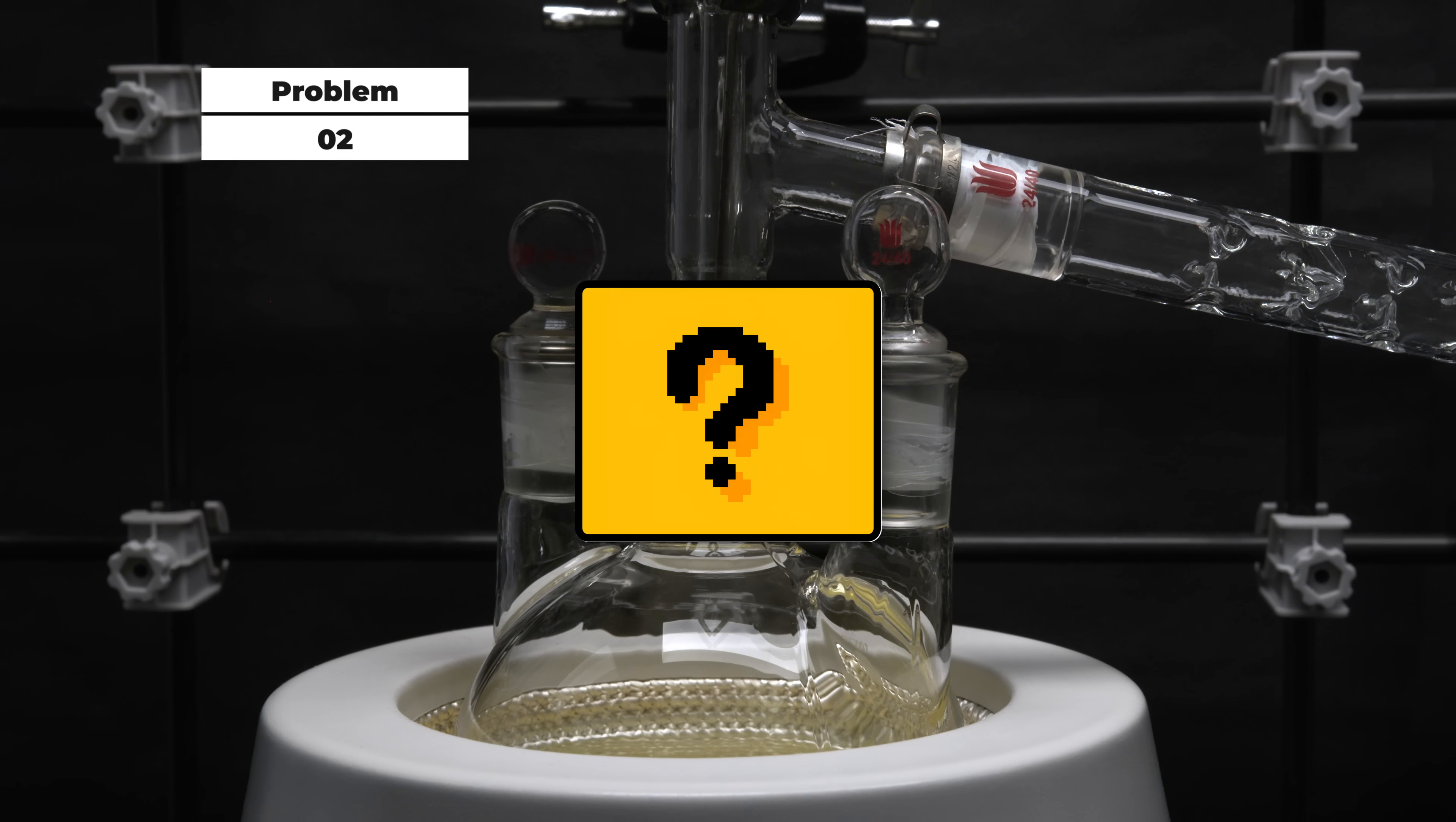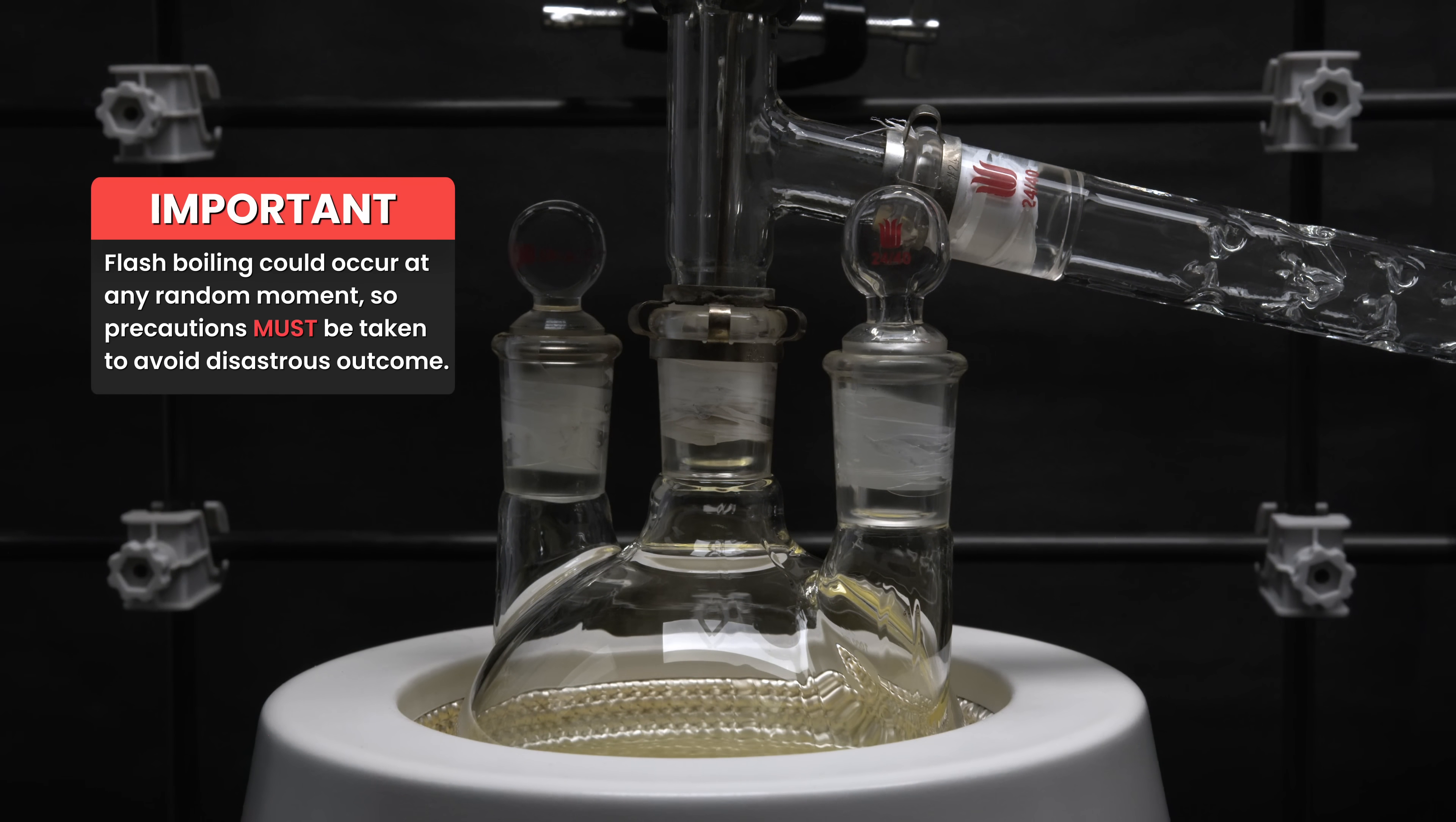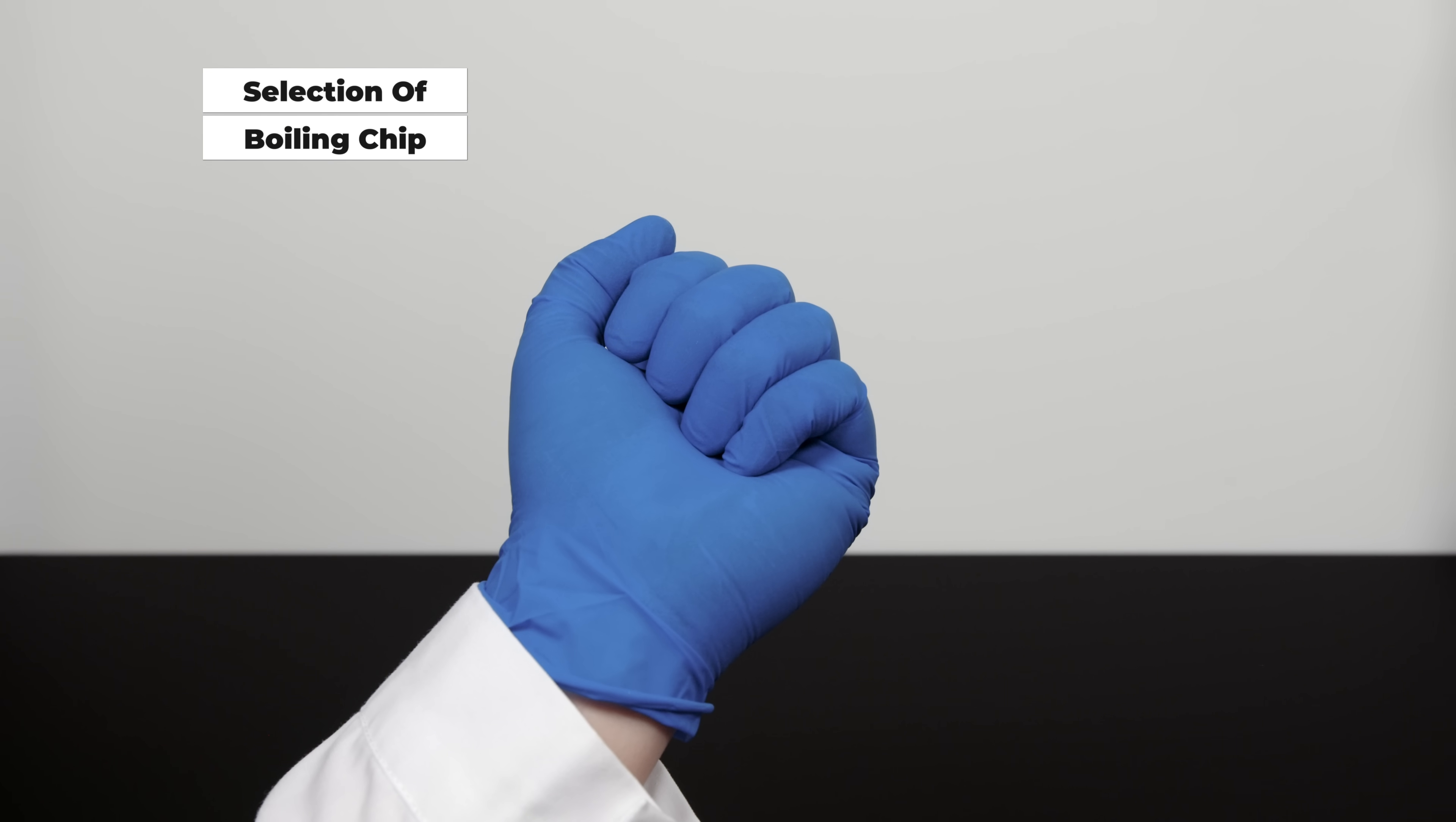This brings us to problem number 2: violent bumping or unstable boiling. As I just mentioned, flash boil or bumping can occur even just because of the steep temperature gradient. It can also occur due to insufficient nucleation sites or critically quick dripping back to the flask. The solution to this is the second component: the boiling chip.